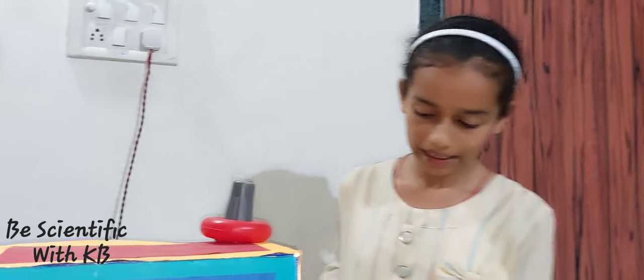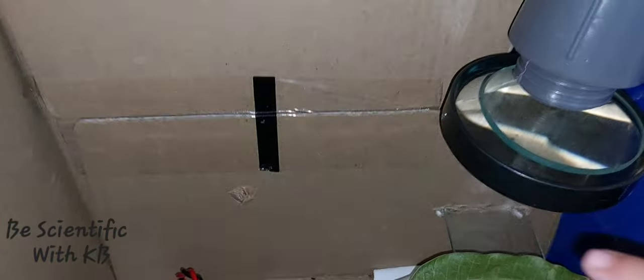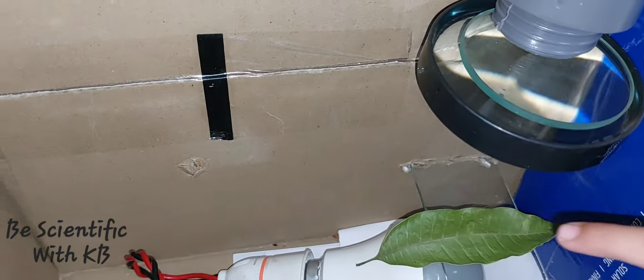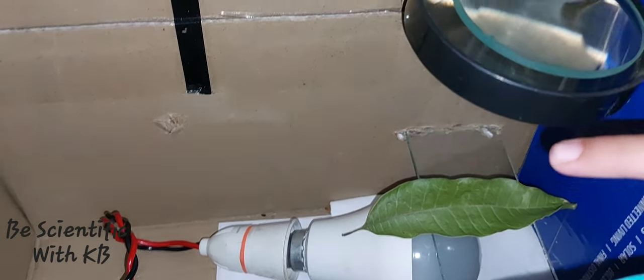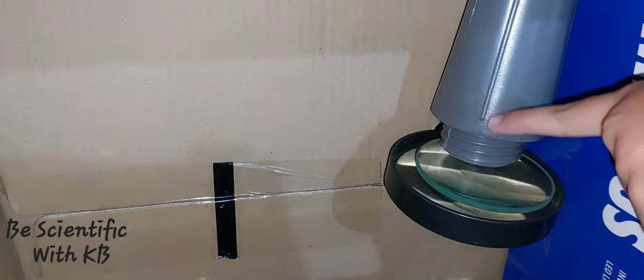For this Boxerscope, there is one piece of glass, and on the down side of that there is a bulb. On that piece of glass, I placed a leaf, and on the up side of that leaf there are two lenses, and on top of that there is a toy.